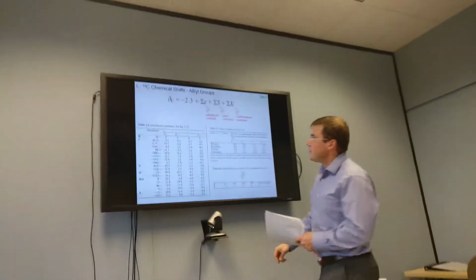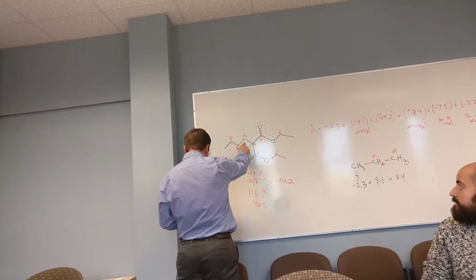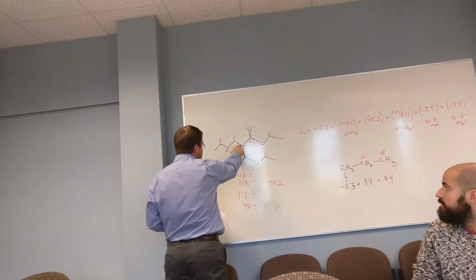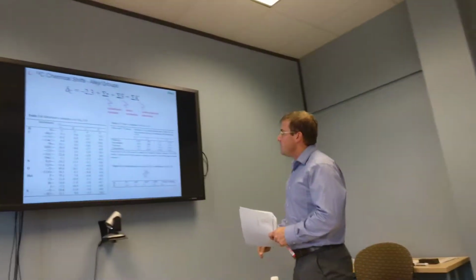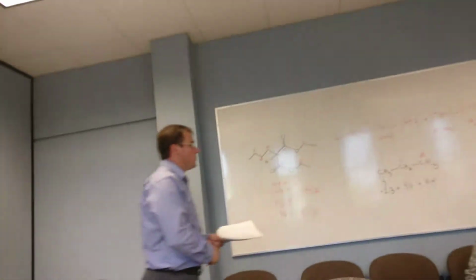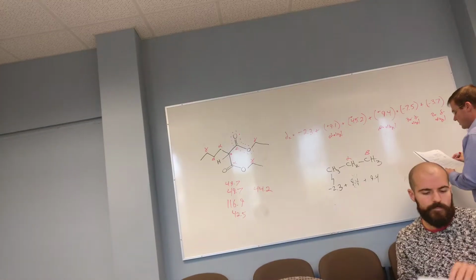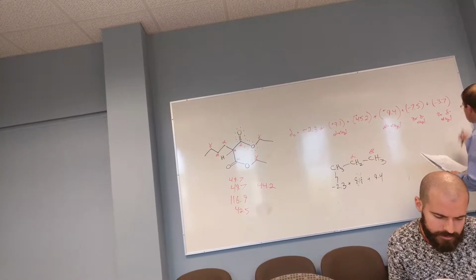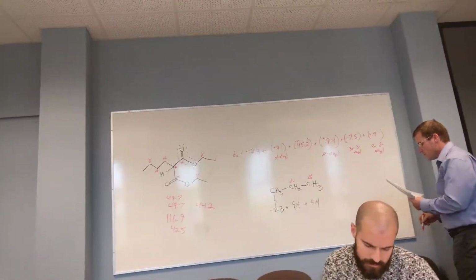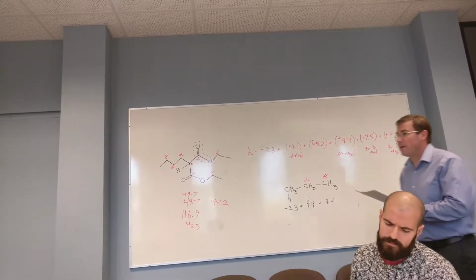This carbon is attached to 2 carbons. And so we have to add that minus 3.7 number for the steric correction. I screwed up here somewhere. Where was my delta alkyl? This was 0.9, sorry. 3 deltas were worth 0.9. The minus 3.7 is our steric correction. Sorry about that. Reading off my notes.